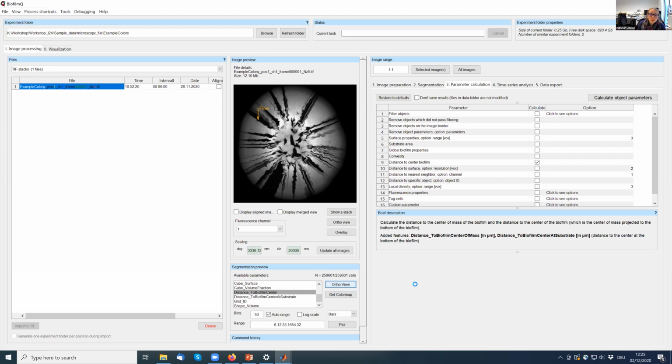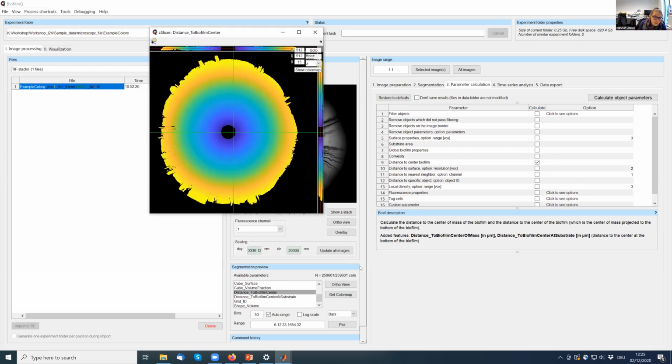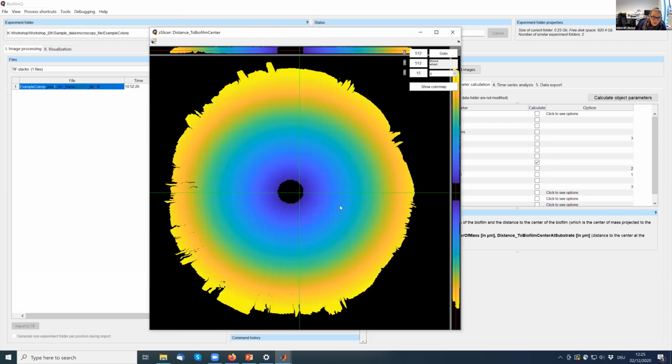I'm going to click on auto view, and we will see now what it looks like. You can see how fine our cubes actually are in this example, and you can see how it nicely changes from inside to outside. And this black area on the inside is just because anything closer than 200 micrometer towards the center is black in this color map, and this is why there's this central area black. But there are actually cubes there. They're just so dark in this color map that we can't see them.